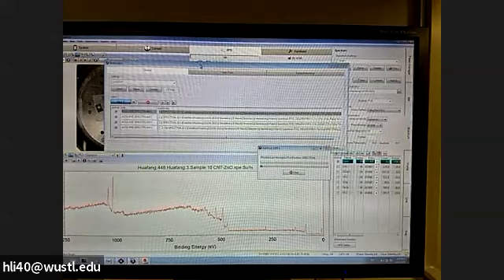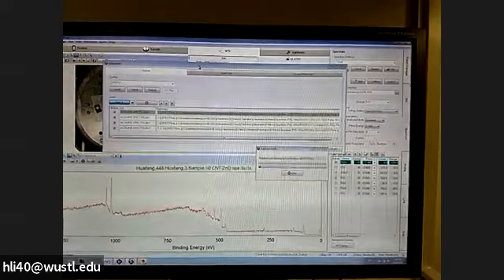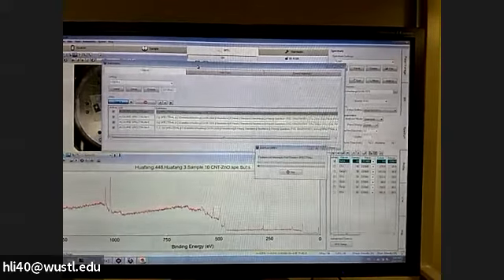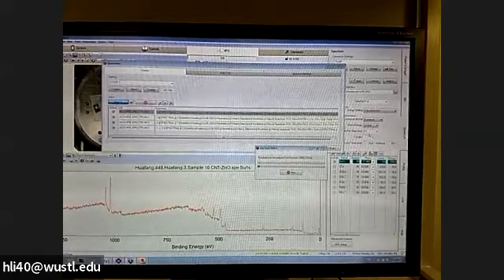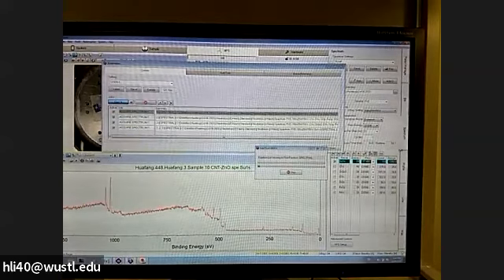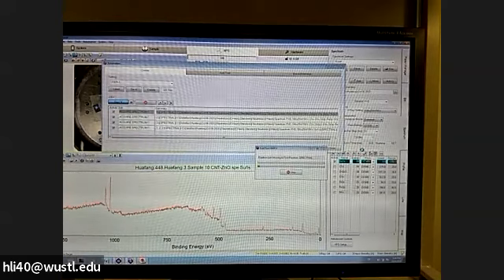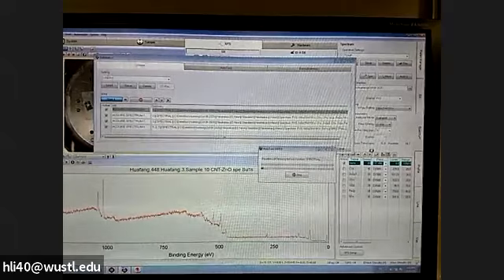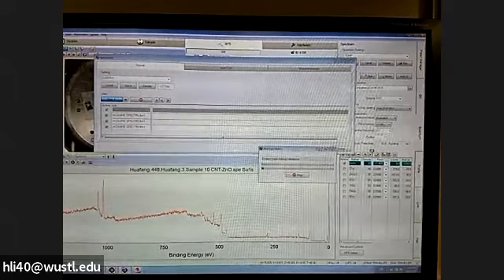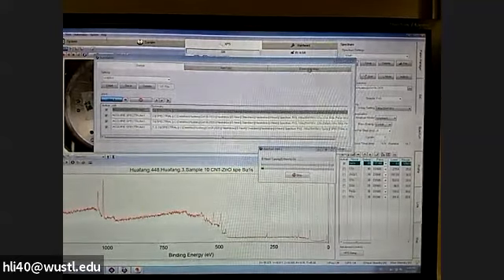Then we can watch, or you can just leave the room and come back to get your data the next time. But please also put in the actual machine time. When you set up, you have a runtime there for each sample, showing how long it takes. Put all this together, add it up, and note this is my total machine time. We will put it in the QR code log comment, so we can note down how much actual time was used.